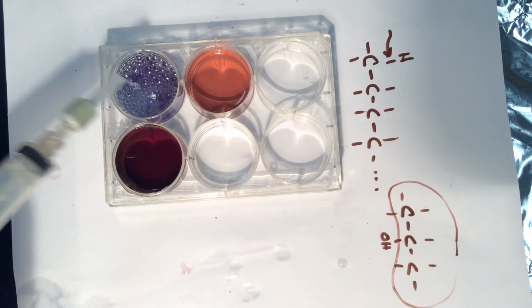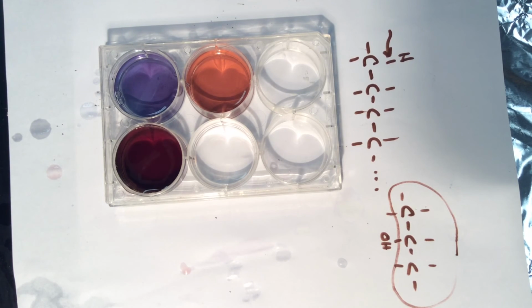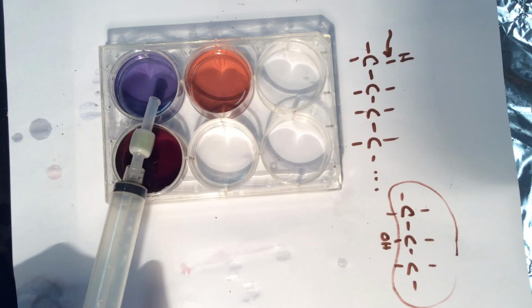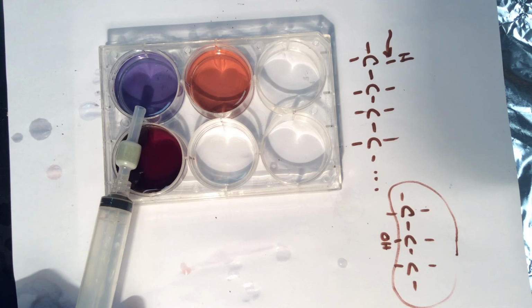So I was able to separate this mixture of red and blue dye based on their solubilities. Now I used column chromatography. Notice something, I separated volumes. I was able to separate volumes of my mixture. That's what we're after today in lab.